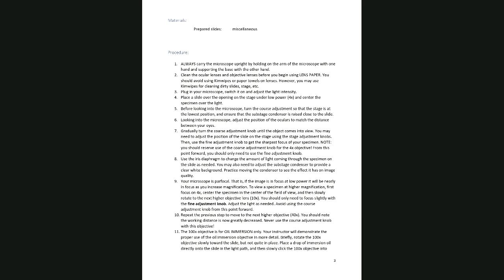Now, when you put on a slide, you'll see something in the video, and I'll stop it just to mention that I disagree with it. The reason why is because we've had some mechanical difficulties with our microscopes, and what the woman shows you doing could actually end up damaging your slide or lens, but I'll get to that when I talk about it.